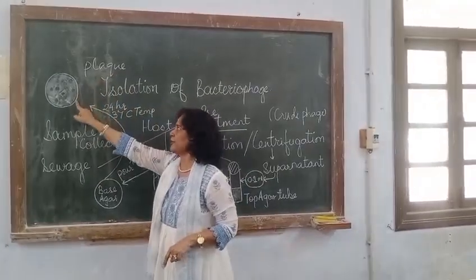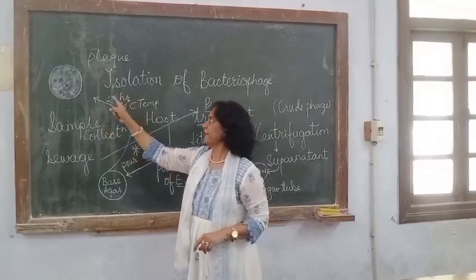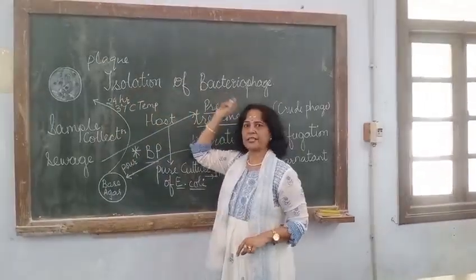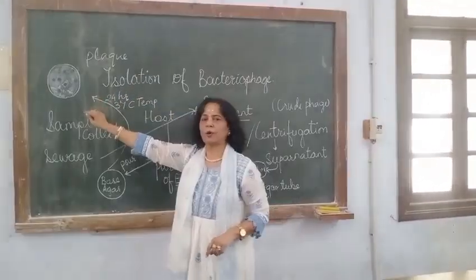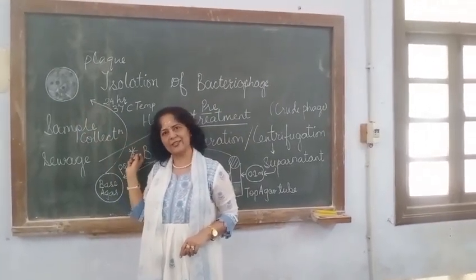So now we are going to observe the plaque, and then we will conclude our result that we can isolate the bacteriophages from the sewage sample in the form of plaques with the help of Escherichia coli host culture. Thank you.